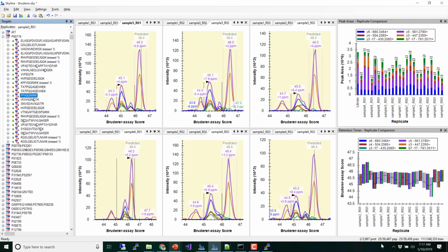But all that said, yes, I did this at the ETH course. I just imported the data as it was done in OpenSwath, and OpenSwath just gave you a bunch of peak areas. You see these same things are happening, and so you can rush past everything to peak areas and do statistics, and you're missing a lot of opportunity for cleanup, and you have noisier data.